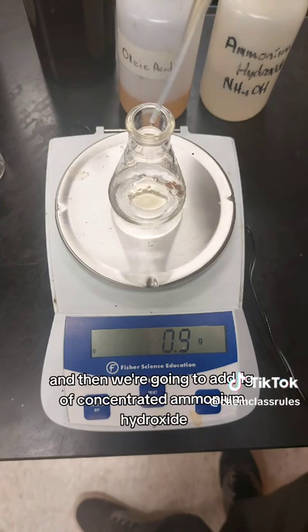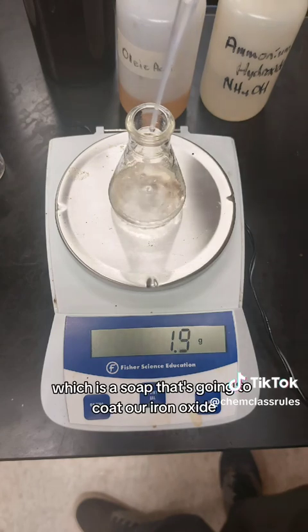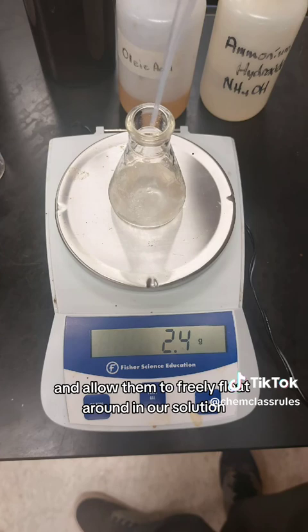Then we're going to add one gram of concentrated ammonium hydroxide. Those two mixed together form ammonium oleate, which is a soap that's going to coat our iron oxide Fe3O4 nanoparticles and allow them to freely float around in our solution.